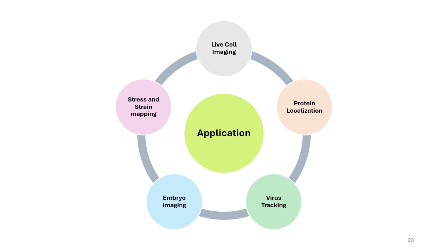So, in this talk, I have discussed the basic principles of fluorescence resulting from electronic transition, and the principles and rules involved in this fluorescence technique, like the Franck-Condon principle and Kasha's rule, and then I have talked about the instrumental components of fluorescence spectroscopy along with the new advanced techniques of fluorescence microscopy and their workings also.